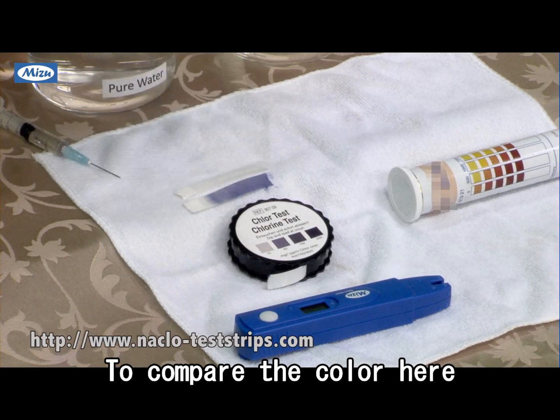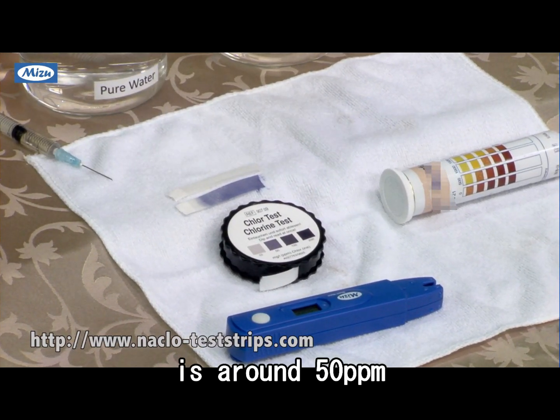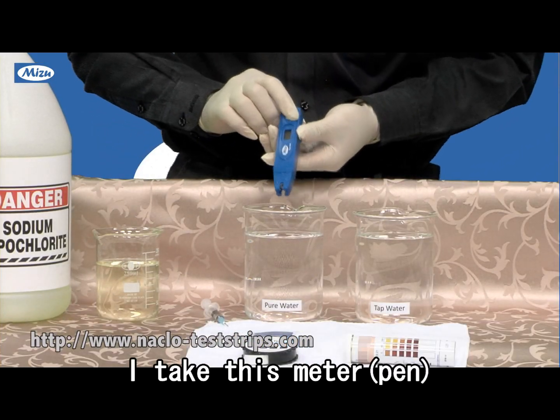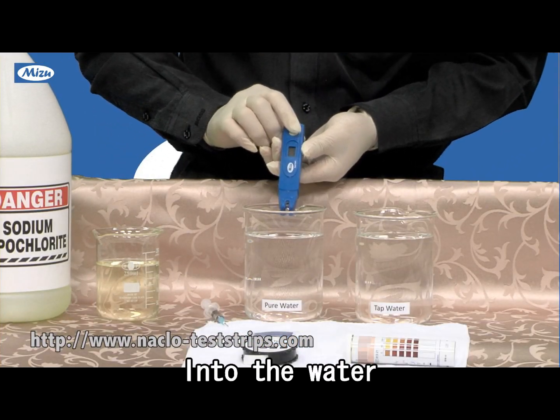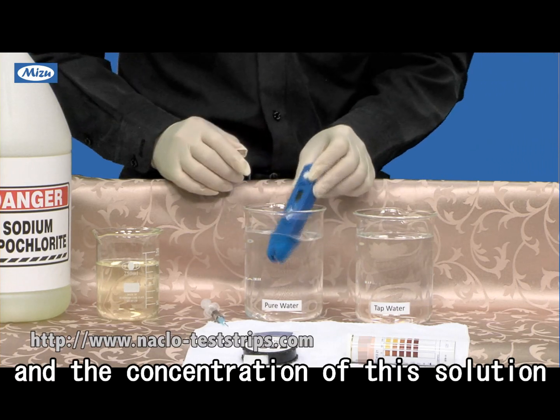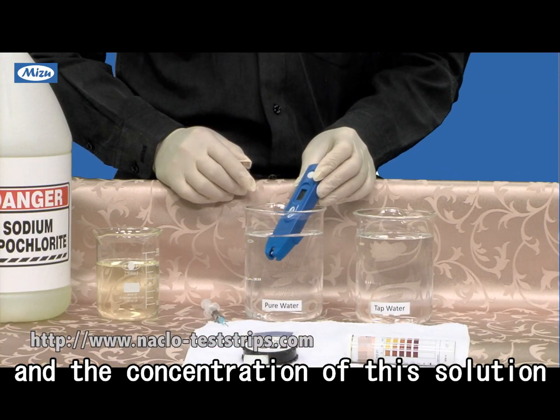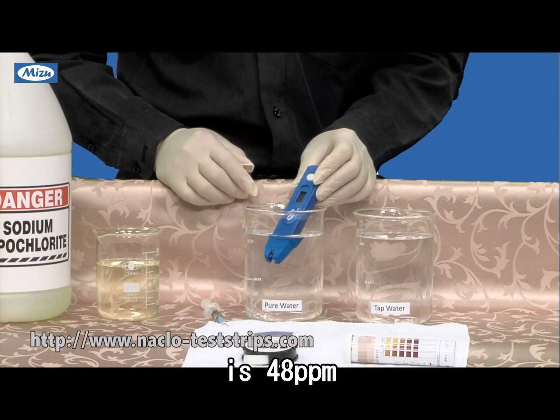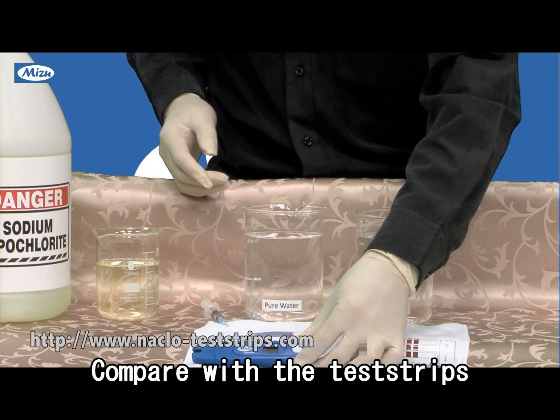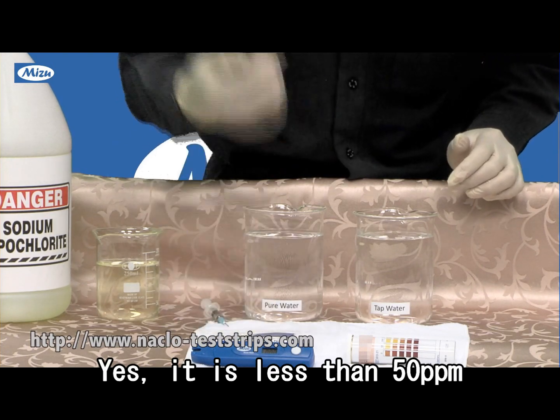To compare the colors here, it should be around 50. Now I take this meter, this pen, in the water, and the concentration of this solution is 48. Compared with the test strip, it's less than 50.